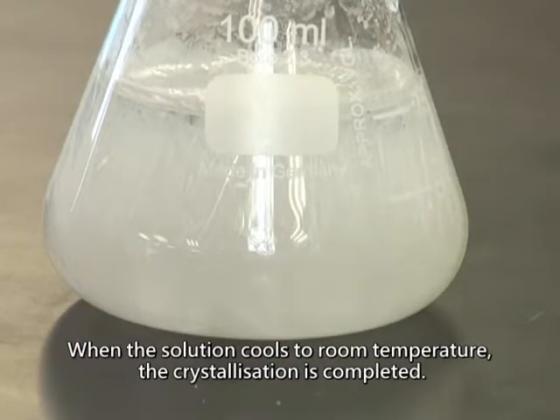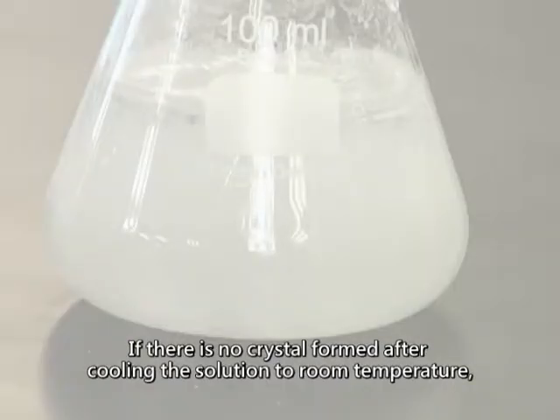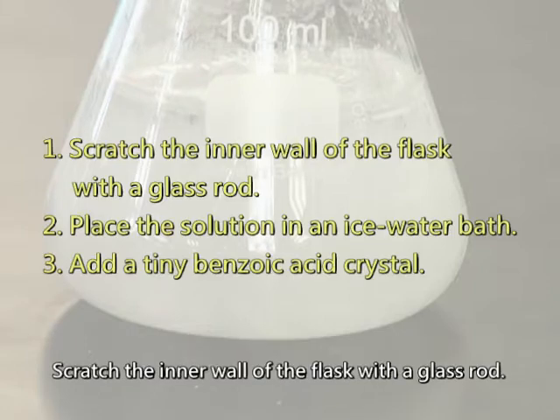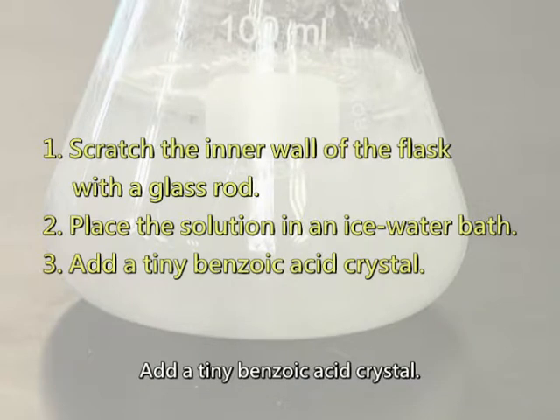When the solution cools to room temperature, the crystallization is completed. If there is no crystal formed after cooling the solution to room temperature, the following methods may be used to induce crystallization. Scratch the inner wall of the flask with a glass rod. Place the solution in an ice water bath. Add a tiny benzoic acid crystal.